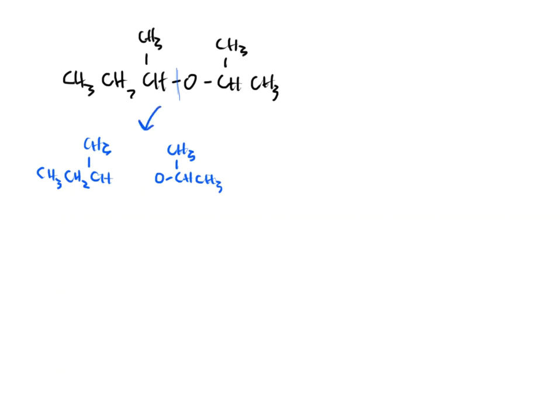The oxygen will get the negative, so I'm putting a negative there, and the piece to the left-hand side will get the positive, and that will be seen by the detector. This will not be seen by the detector because that's a negative. It will get sucked out.